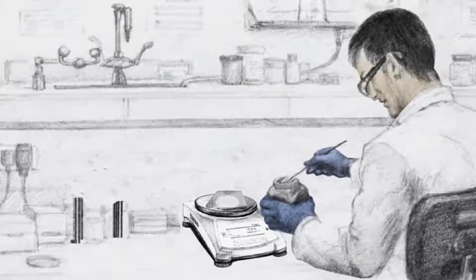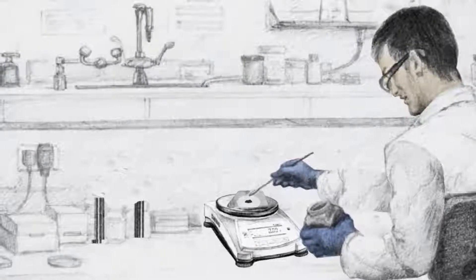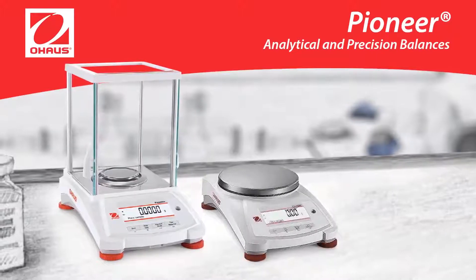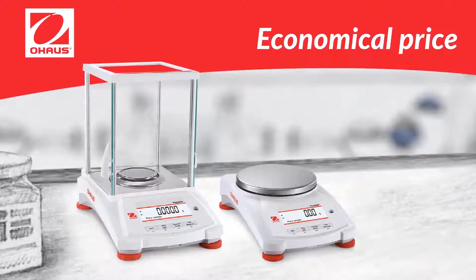In the lab, precision is key. Here's how the Pioneer PX Series analytical and precision balances measure up. The PX offers high performance, accuracy, and repeatability for essential weighing applications in laboratory, industrial, and education settings at an economical price.